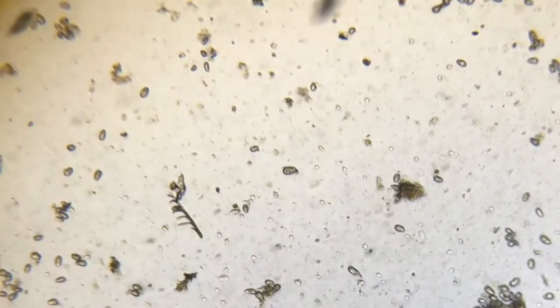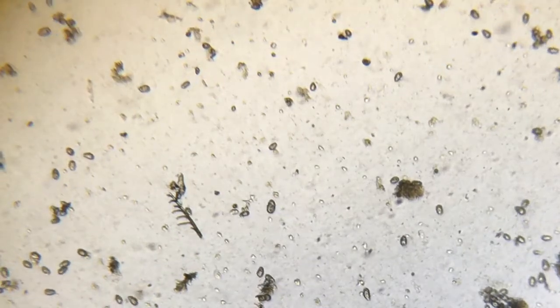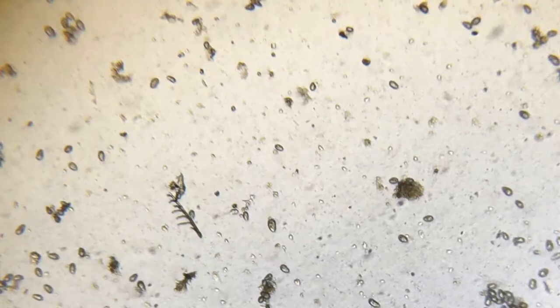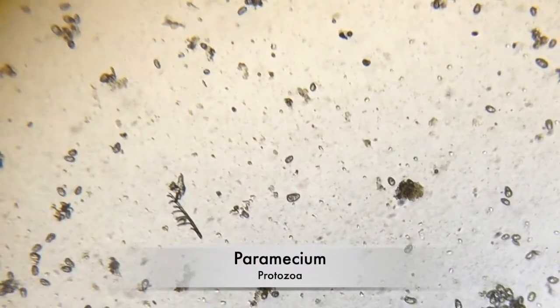Today we'll be talking about different microscopic organisms around different habitats. There are so many different habitats out there. These circular things you see moving around are a type of paramecium. Paramecium are a type of protozoa, or protists.